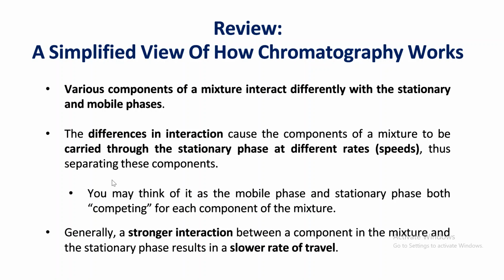Some compounds are more attracted to the silica plate, and other molecules are going to be attracted to the solvent, or the liquid that is traveling up the plate. And the distinction or the relationship between these two interactions allows us to separate the mixture.